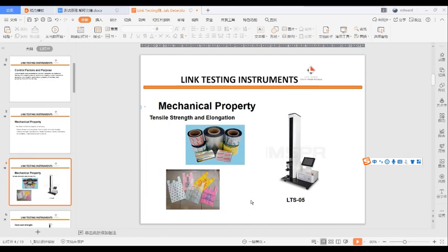In fact, this machine is very popular in the packaging factories and some food and medicine packaging QA and QC labs. If the tensile force is very small, the packaging is very easy to leak. Every food or medicine, after the production, must be stocked, transported, and then sold to the customers.